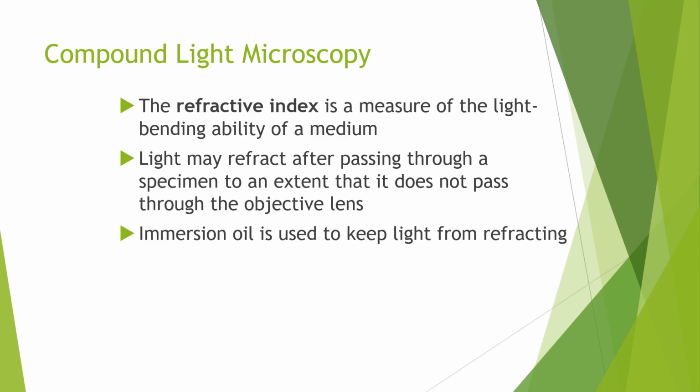There's another term called the refractive index, and refraction of light is basically the bending of light. Light has the ability to bend, and it usually bends when it hits two different media. Right now there is light hitting your eyes, and that's why you're able to see. If you think of the light beam, it's traveling in air first before it hits your eye. So it's traveling in an air medium.